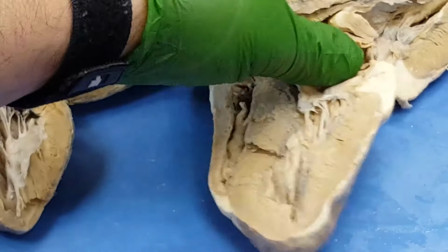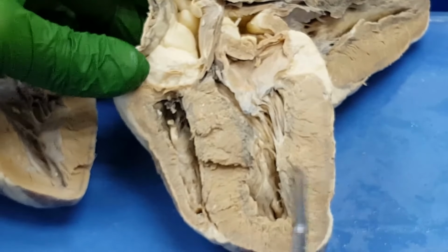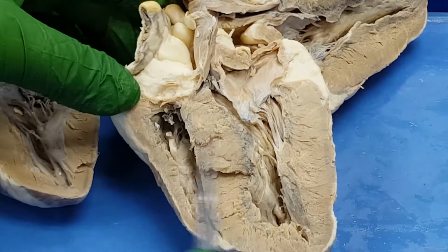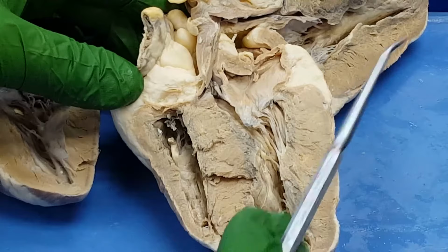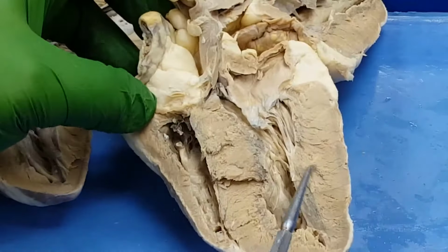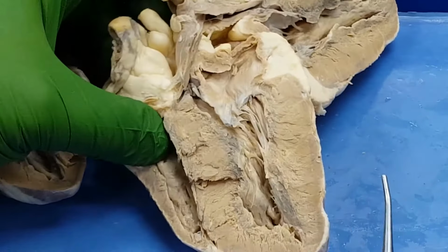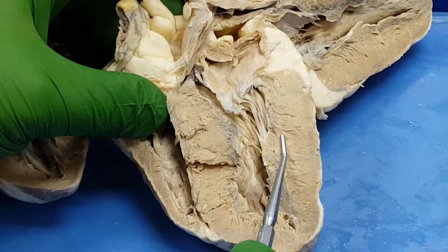See, I've already dissected this one, so it opens like the hood of a car. And I see the much thicker left ventricular wall, much thinner right ventricular wall to orient me. This right ventricle is pumping blood to the lungs and back. And in case you didn't think about it, remember your lungs are located just on either side of your heart. It's not that far away as compared to the left ventricle, which has to pump blood into the aorta, into systemic circulation you'll talk about in your lecture, which means everywhere. That's not the lungs. So a much greater distance, a lot more myocardium right here.